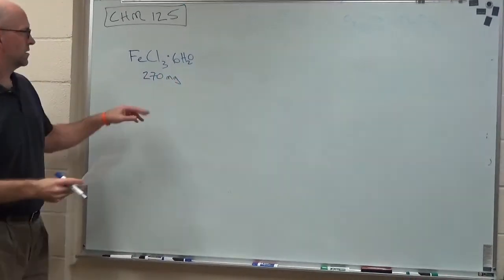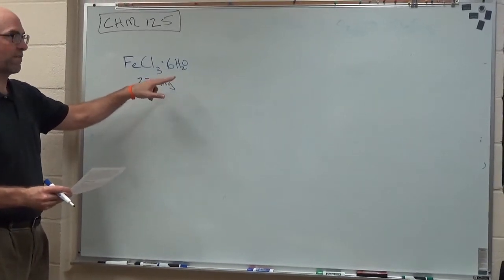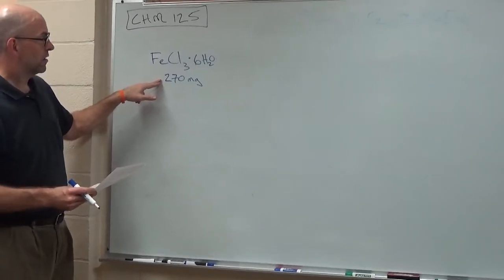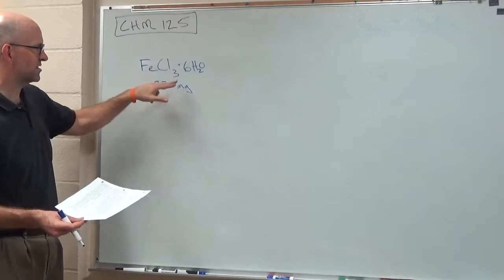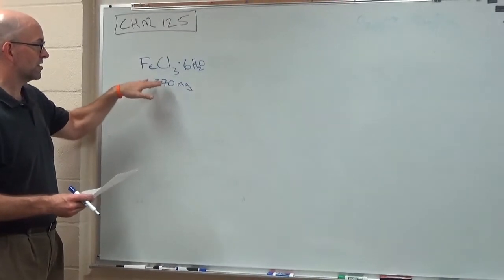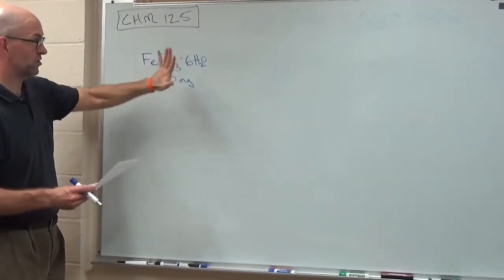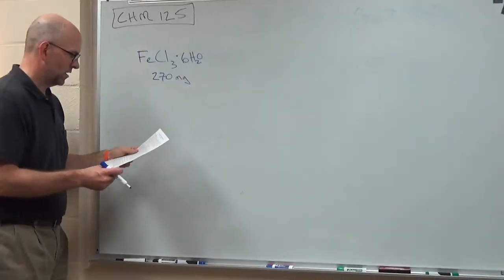Now right away, milligrams, so that's 10 to the negative third gram, so you can do the math. So you're going to go to the balance room and mass out approximately 0.2700 grams, because we have four sig figs. So the procedure, this is what you want to shoot for. Don't worry if you don't get exactly this. Just record what you do. So don't use these numbers other than just a dry calculation.